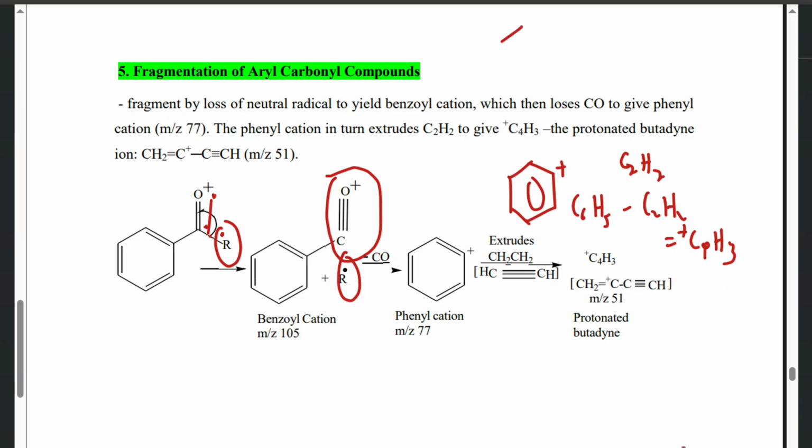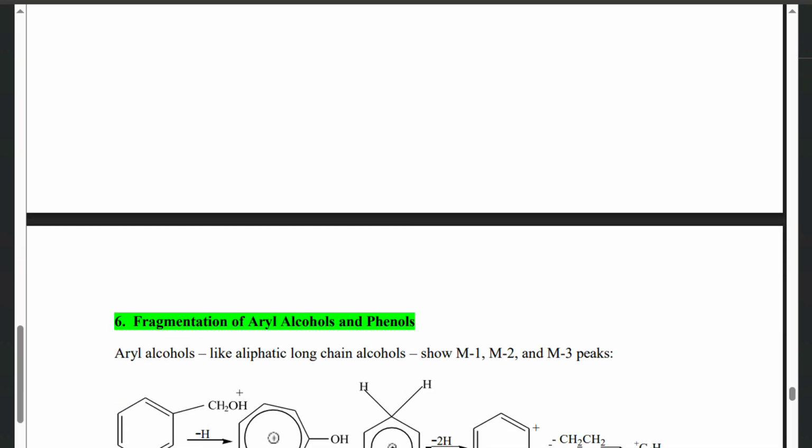So let's say it's even 7. We're still going to remove C2H2, and then you get the necessary product. So that's that. So now let's look at this final one.